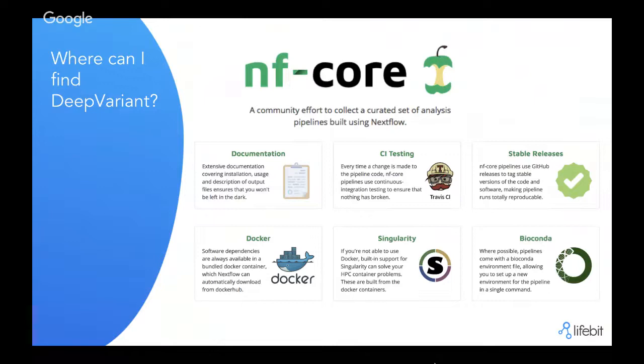It's also really useful in the case of DeepVariant, because that's how we build all the pieces that DeepVariant is composed of. We can build them extremely easily in the pipeline, combining Docker containers or Singularity together with Bioconda, where if you look at the Bioconda repository, for example, you will even be able to find the latest versions of DeepVariant.